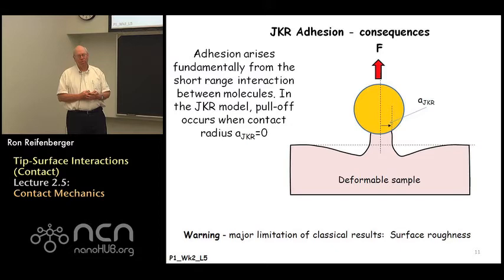They won't be applicable. I guess it's probably more correct to say you have to take into account the surface roughness. So you have to develop a model that adequately takes into account the surface roughness before you can start to apply these equations and get results that you can believe. So that's something you always have to remember when you read the literature and you find different research groups apply these models. They're assuming this surface roughness is basically zero.